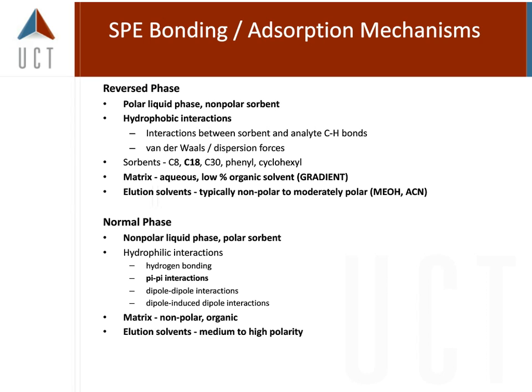We might be starting at 5 or 10% to put our compounds onto that LC column to then take them off slowly as we move that gradient. Well, when we do solid phase extraction, we're putting our compounds onto our phase using 100% buffer, 100% aqueous. We do our washes, which are sort of gradient washes, and then we take them all off using a strong organic. Well, that is essentially why it's been termed start-stop chromatography.